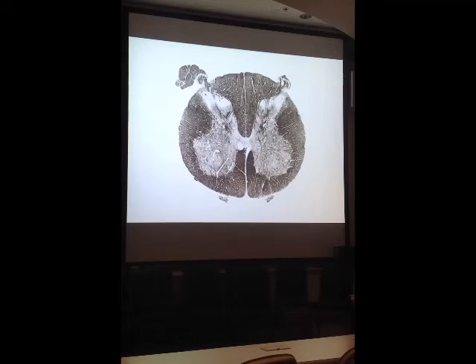Again, on this kind of a lumbar cord, you can see a big fat ventral horn, you can see a big fat dorsal horn here. And you can see here evidence of what lamina that helps to make up the dorsal horn of the spinal cord? Lamina 2, also known as substantia gelatinosa. So lamina 1 is just going to be a thin area out here. You really cannot define the exact border of lamina 1. And then what structure dominates this area through here? Lissauer's tract on that side and here on this side.